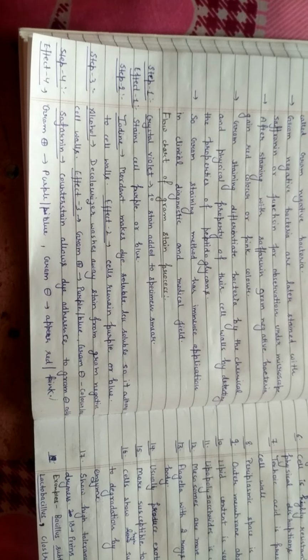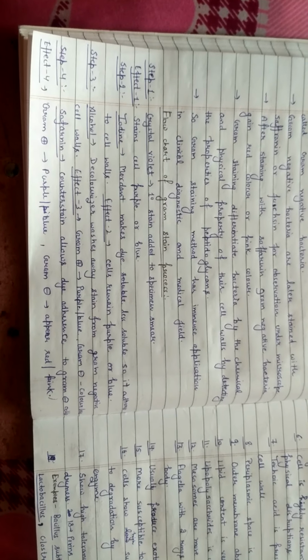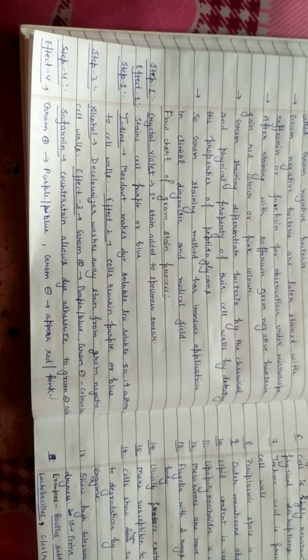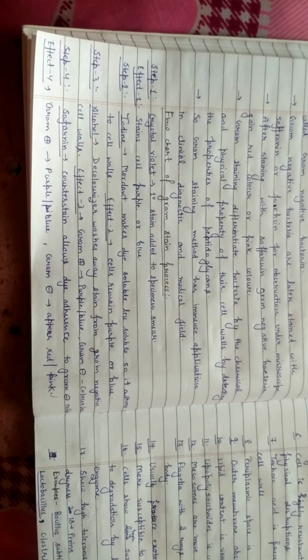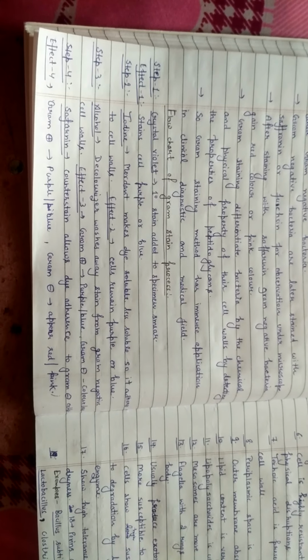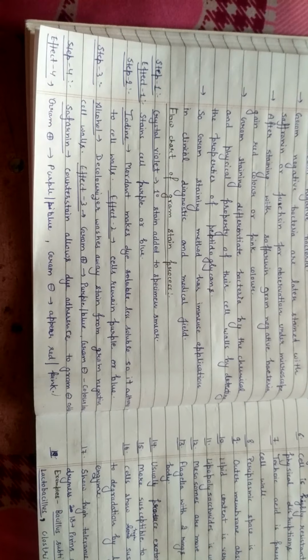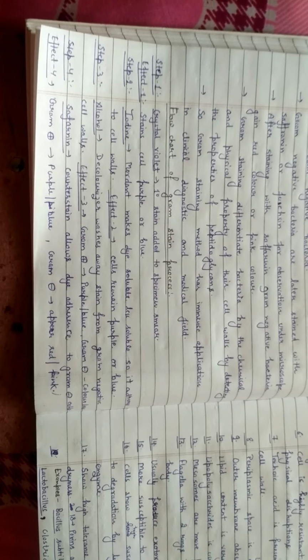The next step is treatment with iodine. Christian Gram treated both the bacterial species, which were already purplish or bluish in color, with iodine. Iodine is a solution which makes the dye less soluble.